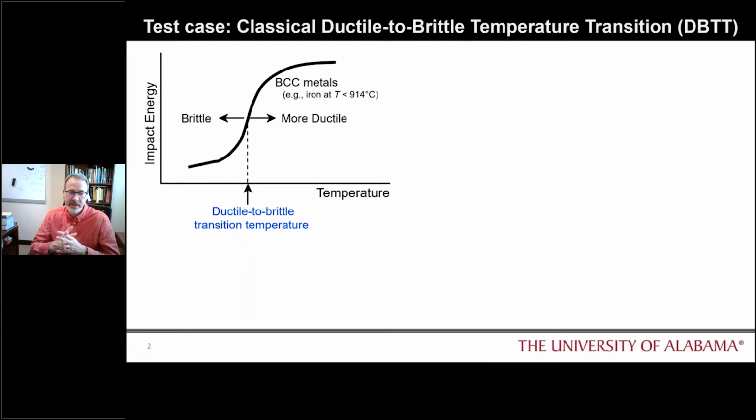What we wanted to do was take advantage of the micromechanical testing you can do with these types of tools, by sampling within one or a few of the grains where that pearlite structure existed. So we could avoid, for example, the large cementite grains, or in this case, the fibrous carbon second phase that occurs in the cast iron.